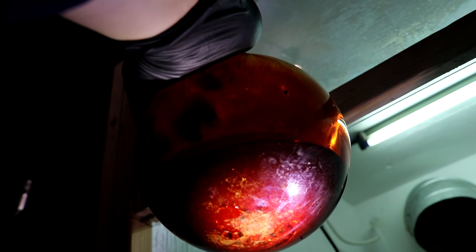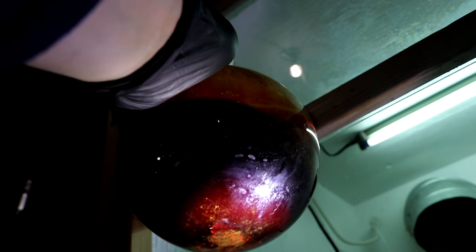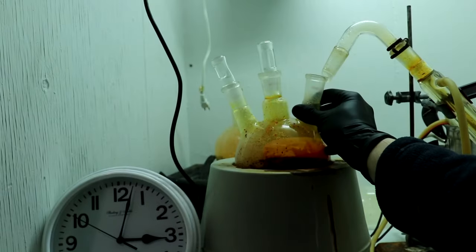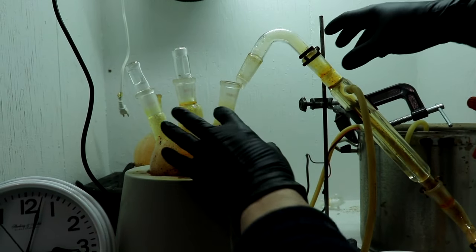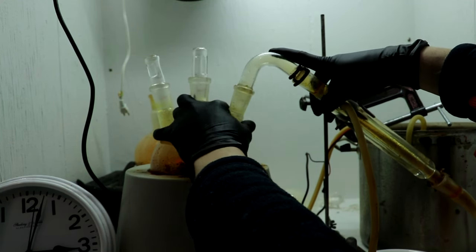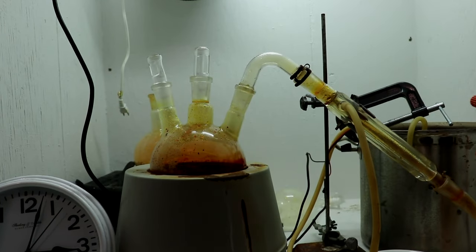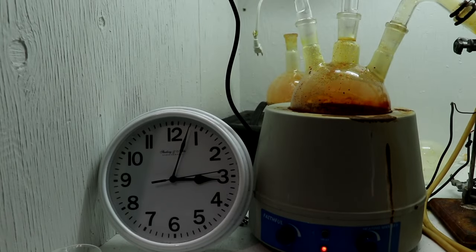But look at this. It's like some just shredded pieces of gold left. It's almost completely gone. That is crazy. That dissolved it faster than the nitric acid would have. I mean, it does help that it was in a thin foil, but even still, that is remarkably fast. I was not expecting that. All right, well, I need to go sleep.